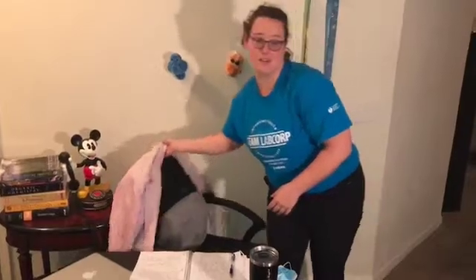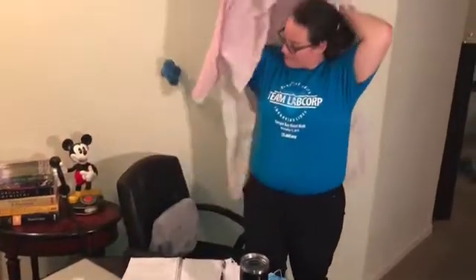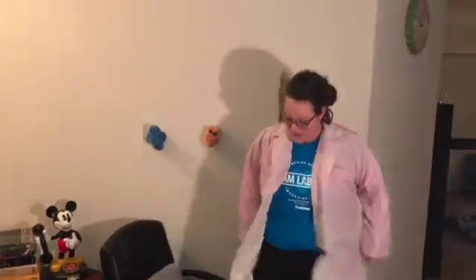So that concludes the Bradford assay. Evidently we're having some quality control testing problems in our lab, so I have to run over there and take care of it. But I hope this video summarized the Bradford assay and you learned a lot more about the Coomassie blue and how it interacts with the proteins.